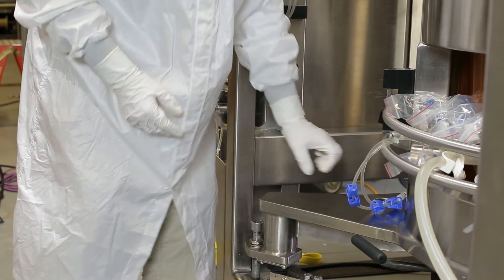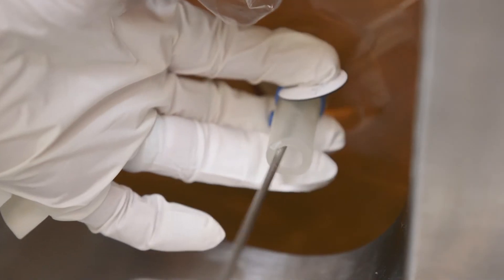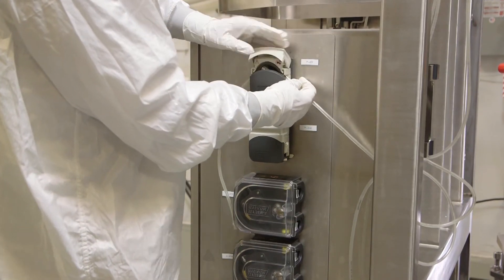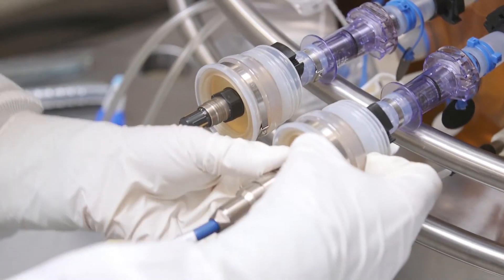Next, close the harvest line found under the vessel with a clamp. Now, insert the temperature probe into the thermowell. Finally, weld acid and base tubing to relevant pump tubing. This groundbreaking 500-liter fermenter is now ready for use.